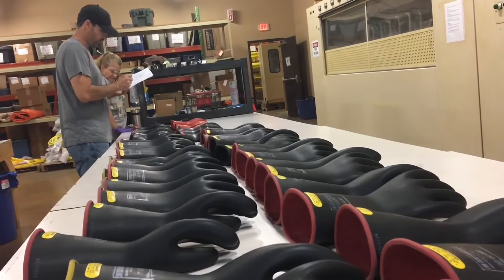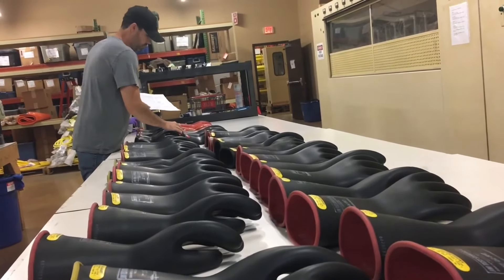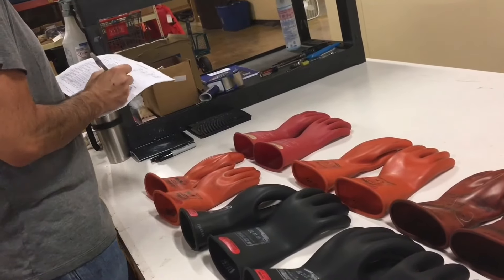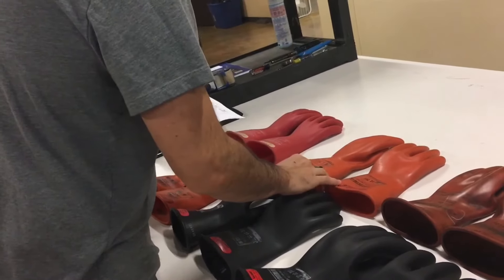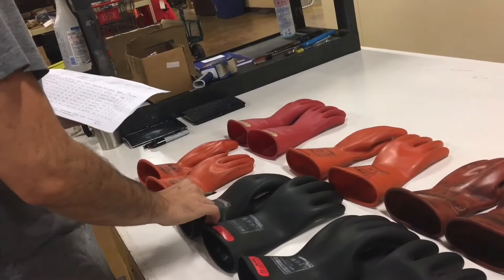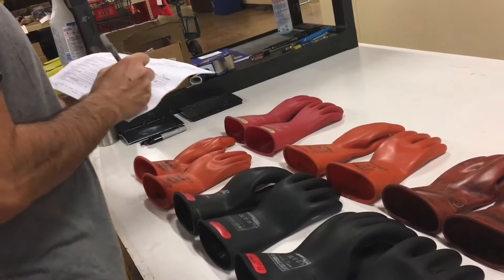The beginning of our quality assurance begins when a lead technician is called to inspect all technicians' stamps for accuracy. All stamps are checked against any paperwork submitted by our customers to ensure special requests are being met and all information has been logged correctly by our receiving department.